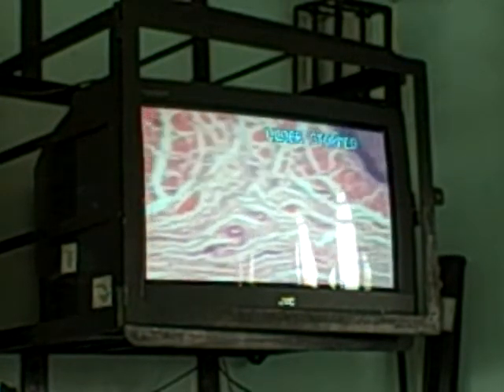Although this slide doesn't have any gland, probably in other slides. It's a blood vessel. Remember, I told you when you have submucosa, that is highly vascular, and they are the one providing nourishment to the upper portion or the lining epithelium. And they have to pass through your loose collagenous portion of the lamina propria.